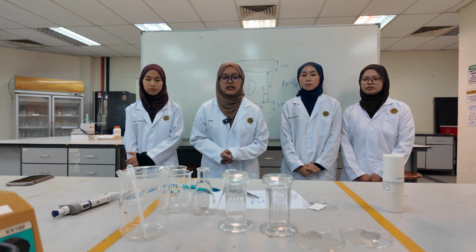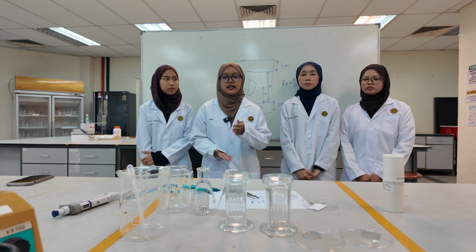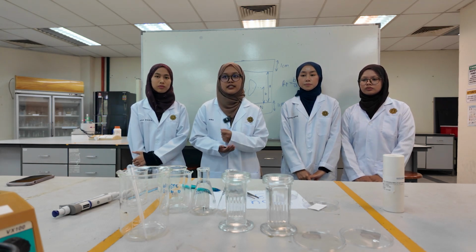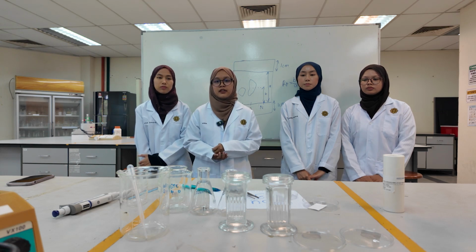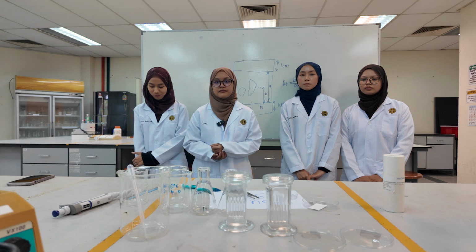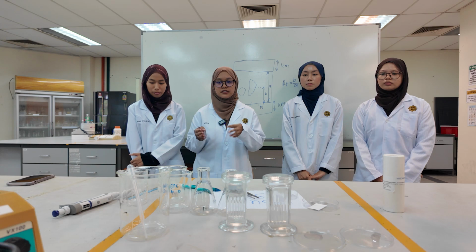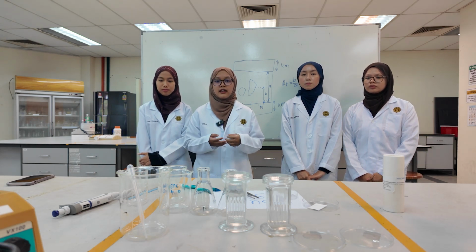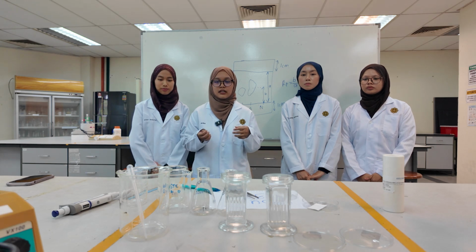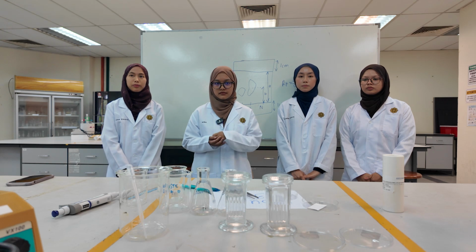TLC is to detect the food colorants, the dyes, and preservatives in final products, so that when we use too much dyes and preservatives, it can be harmful to our health. And so TLC helps to detect whether it's too much or too little.